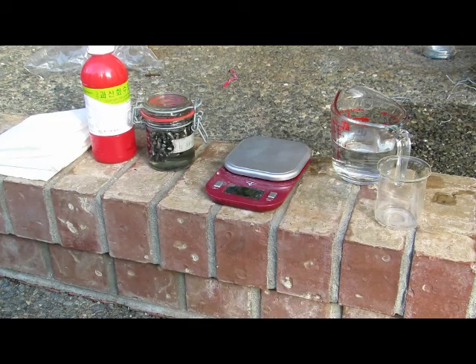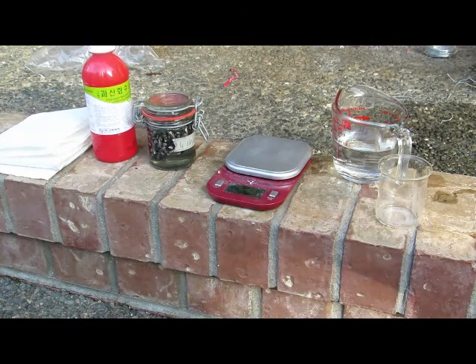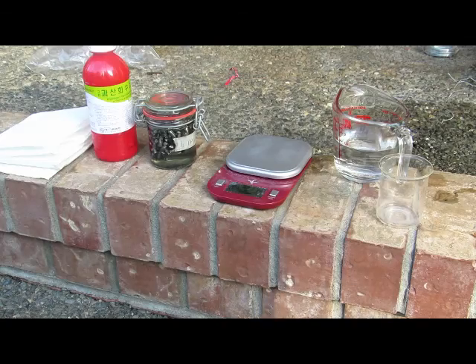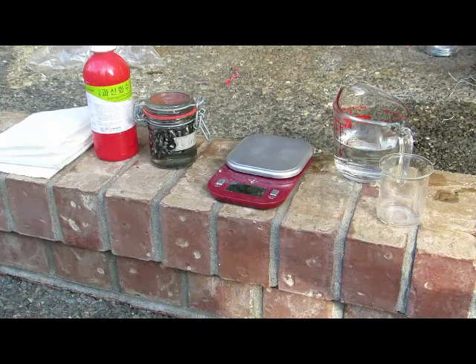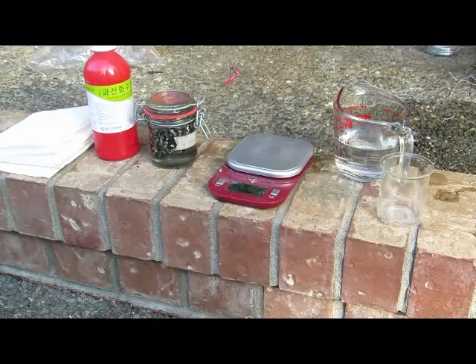Today we're going to be making some for science class. We just need a few things: lithium metal, which can be obtained from lithium-ion batteries, and some hydrogen peroxide. This is 35%, however you can buy 3% in the store and concentrate it. This particular stuff is from Korea — you can find 35% in almost any pharmacy there for about 50 cents per 250ml. In Canada you can buy 30% concentration at the health food store.